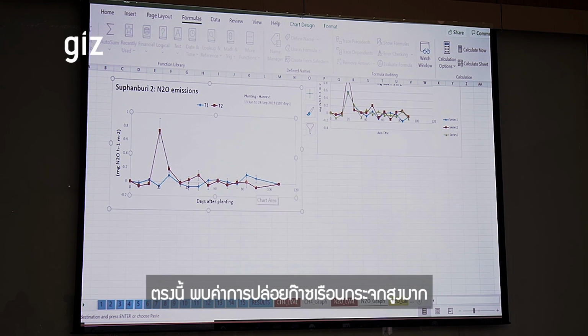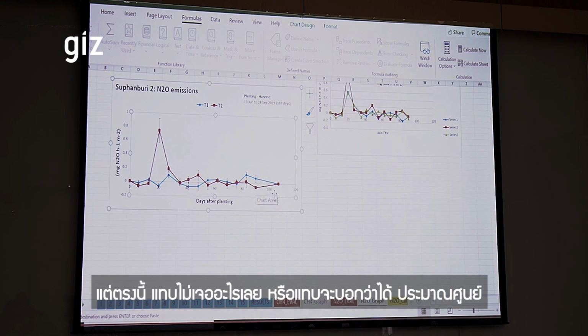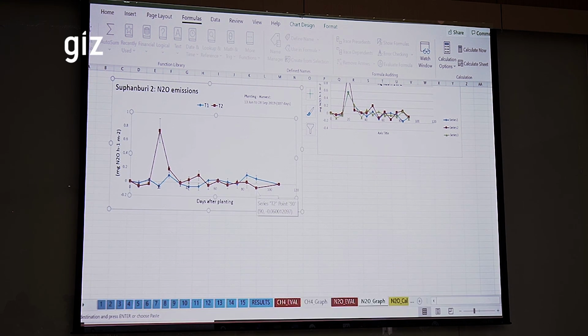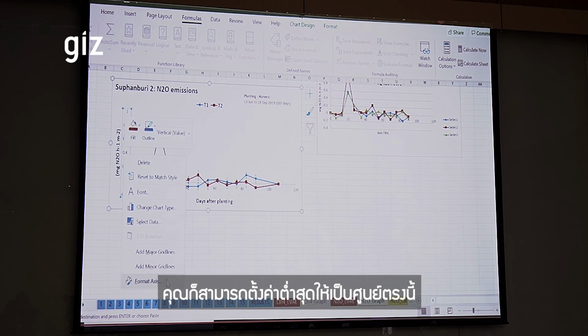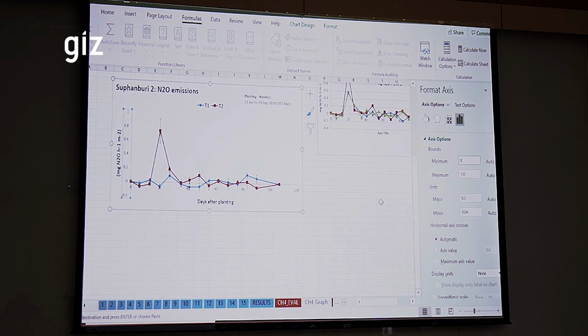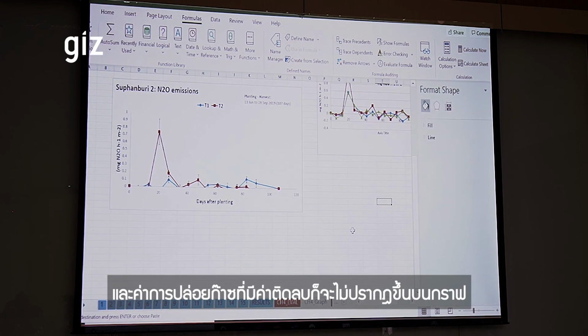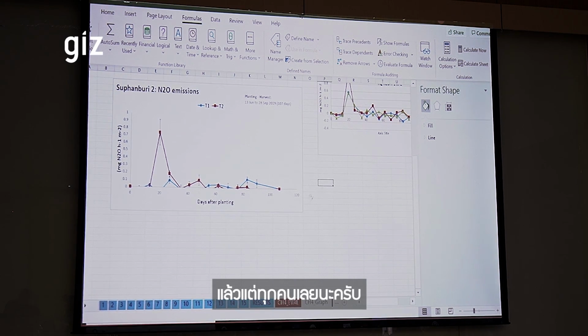So there is some significant emission, but here is not much going on. It's just around 0. So you could put this to 0, and then you would cut the negative emissions away and only have the positive ones. This is up to you.